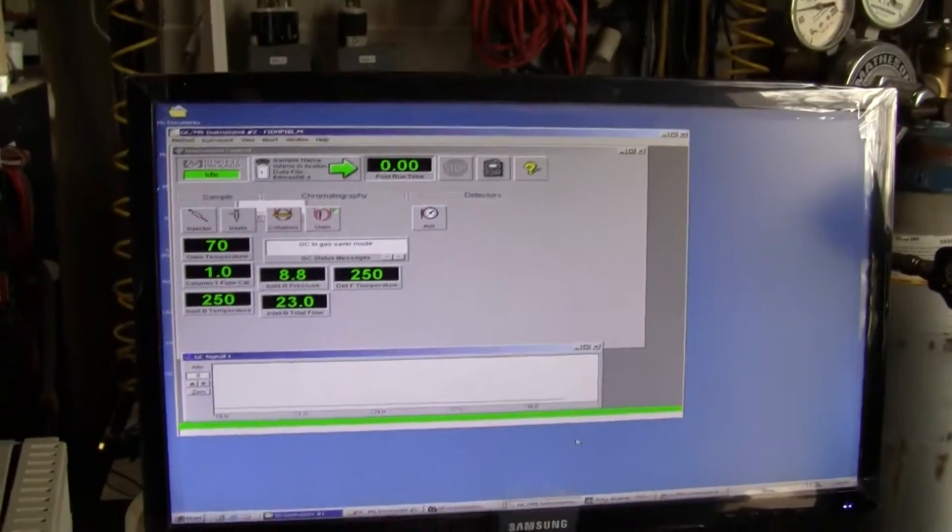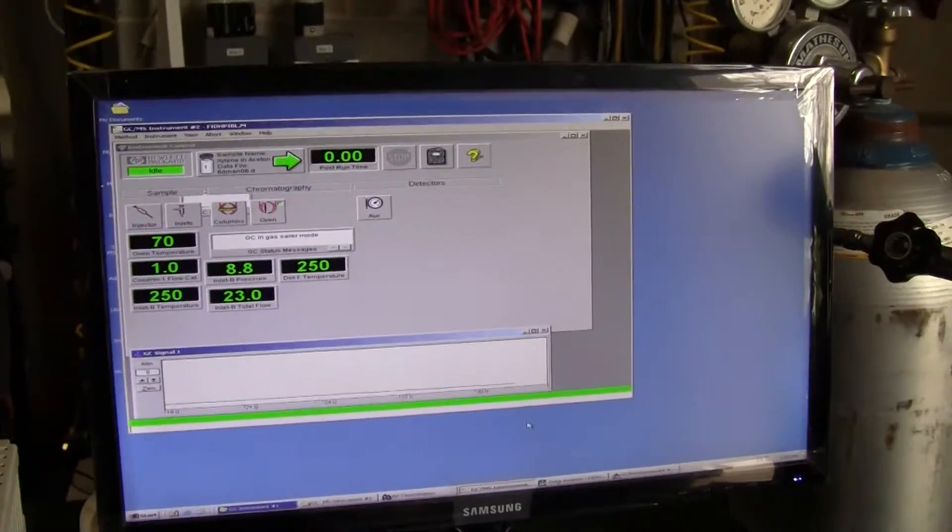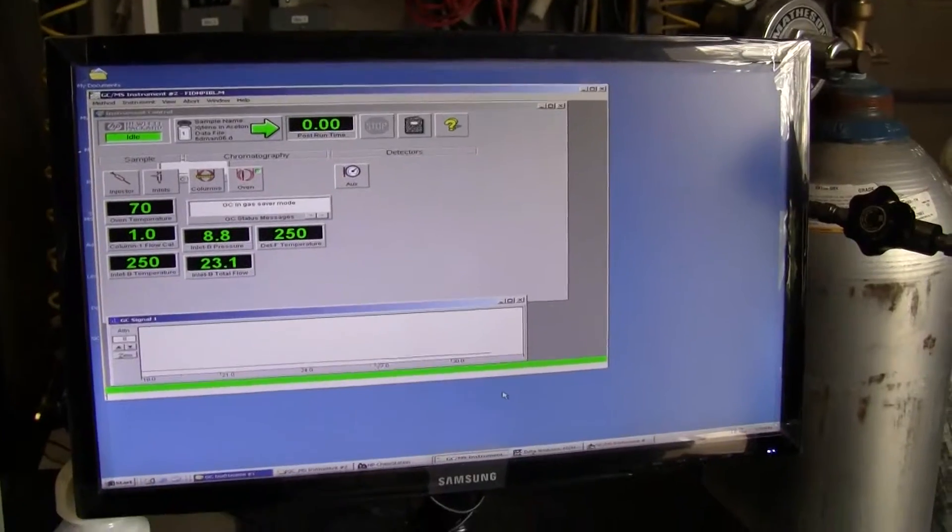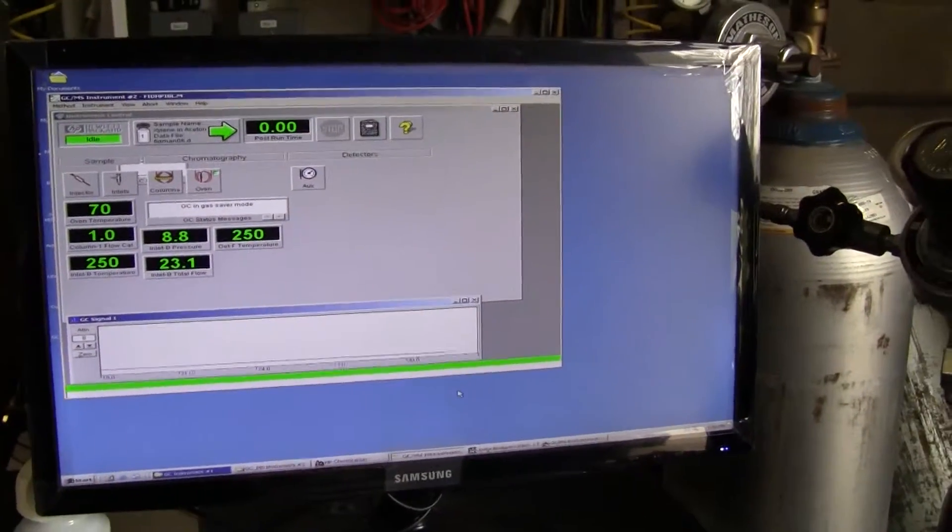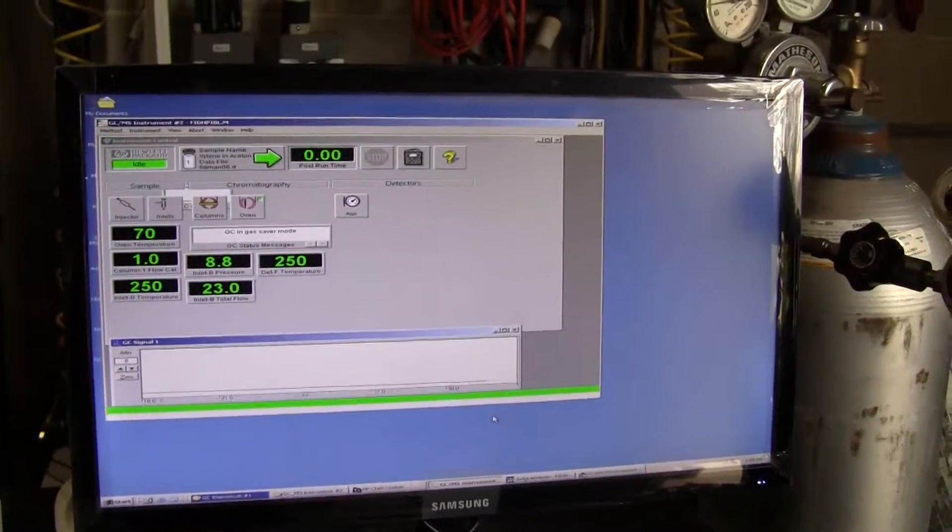we're using GC-MS chem station, which does not come with the instrument. It is sold separately.